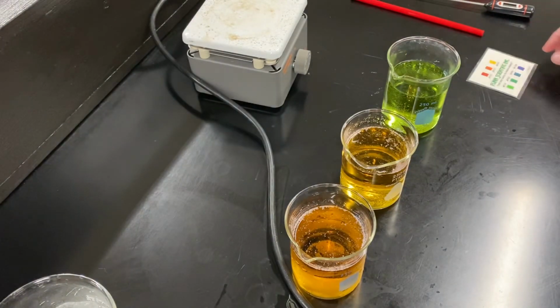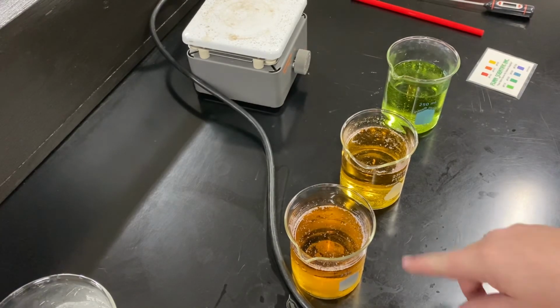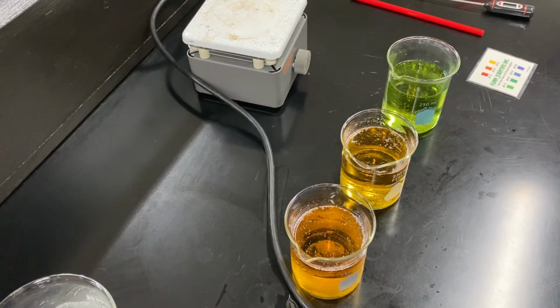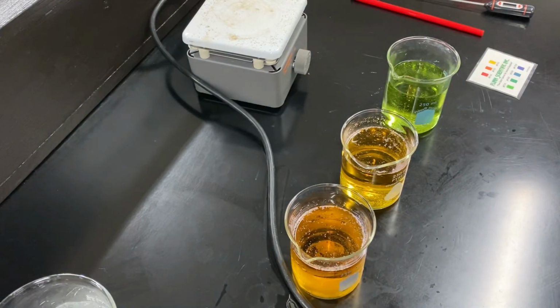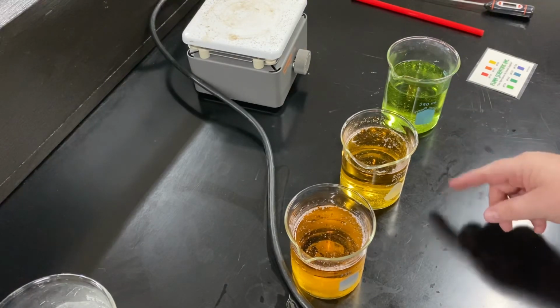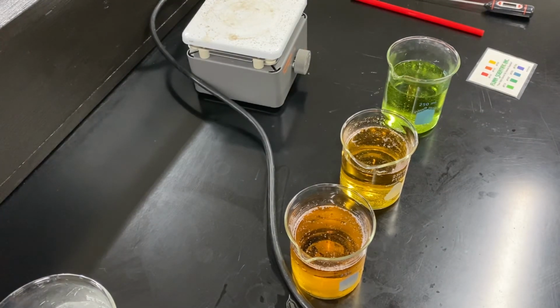What the pH is telling us is how much carbon dioxide is still in the solution. So the bubbles you were seeing, that was the carbon dioxide in the Alka-Seltzer. Carbon dioxide, when it mixes with water, makes an acid. It makes carbonic acid. That's what we get in our carbonated beverages. That's what gives them the fizz.